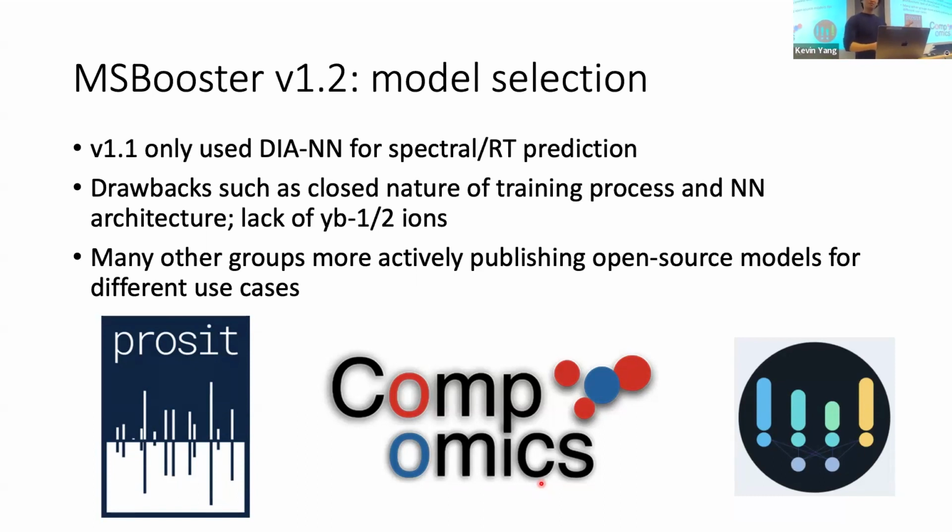So I did some of those entrapment searches before, and MSBooster did not increase the number of false positives in that case. So we're pretty confident that MSBooster is giving us the true positives there. That makes sense.